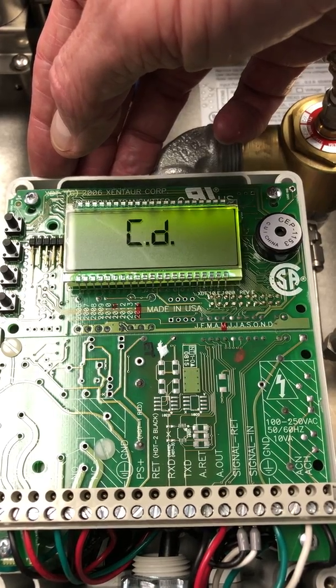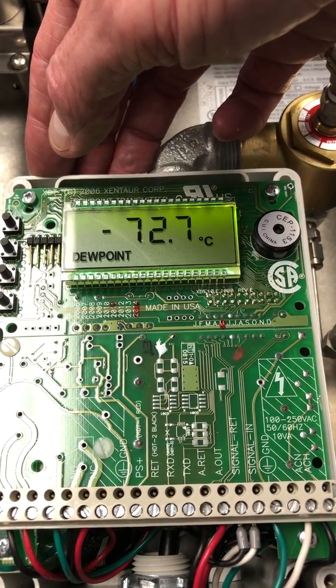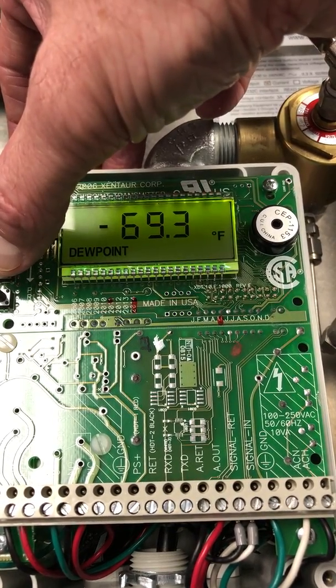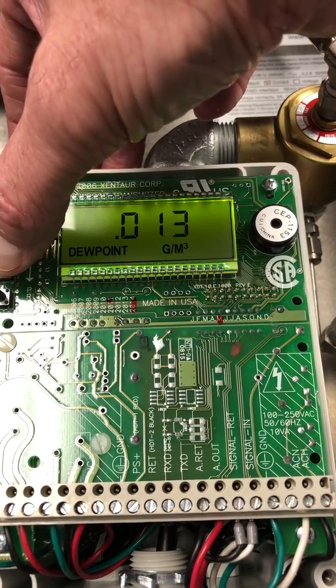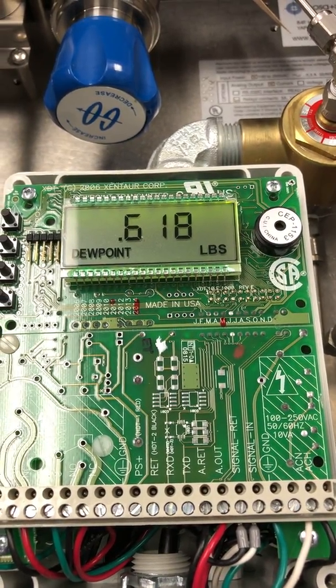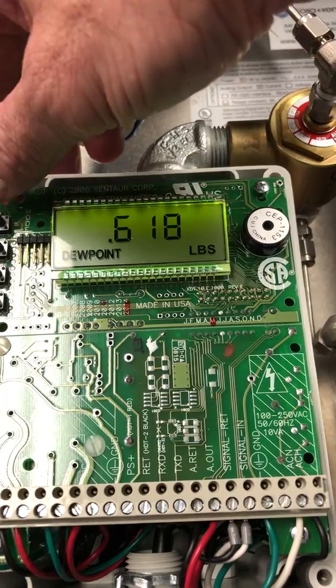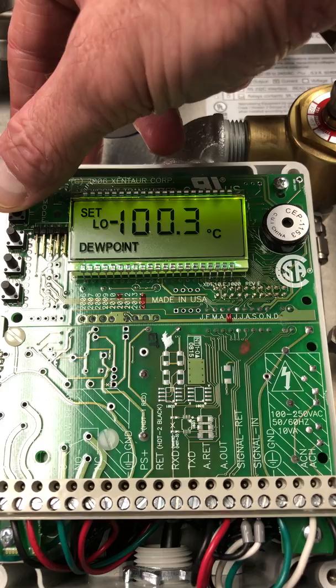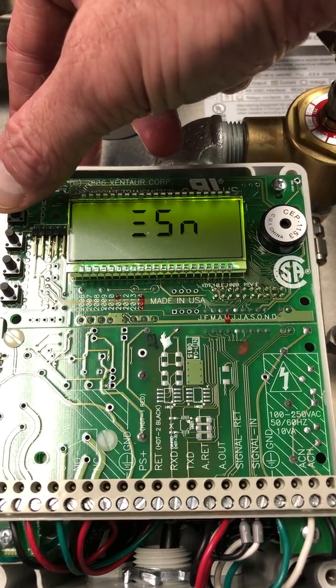Now we're going to change the units to pounds. After we hear the beep, we're going to hit the menu button again to go down to the serial number so we can restart and go into the alternate menu.